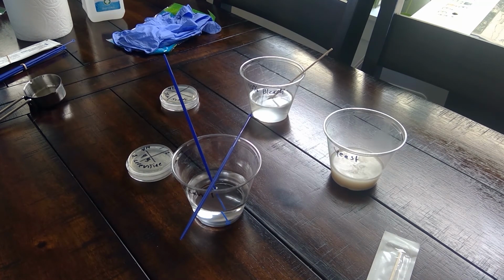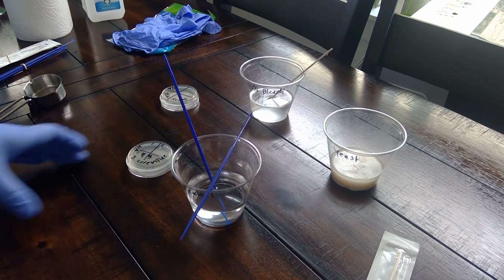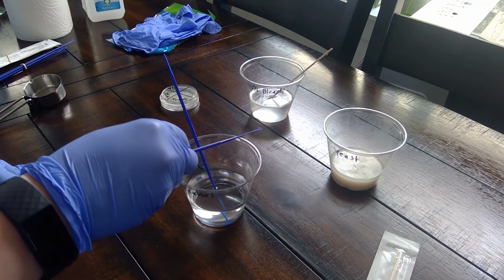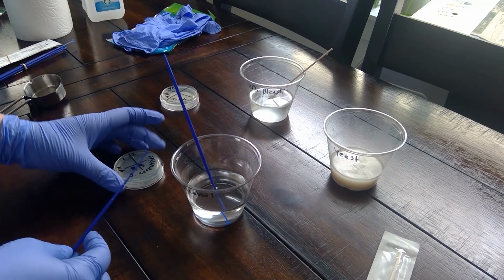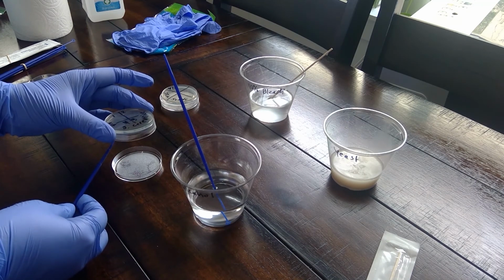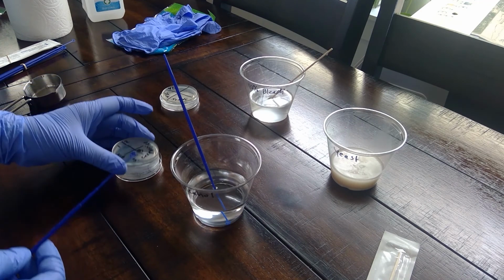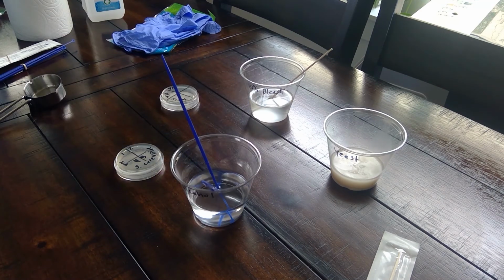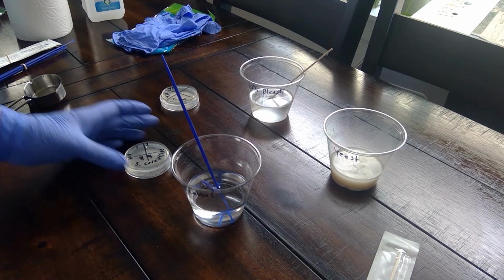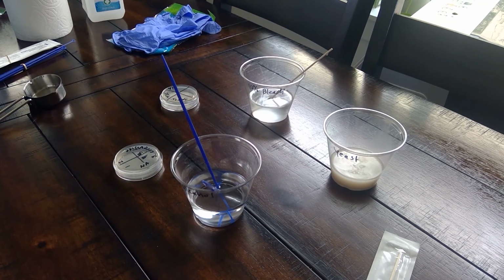And then we're going to transfer from quadrant 2 to quadrant 3. And yeah, this looks dry. So I'll transfer from quadrant 2 to quadrant 3 in a zigzag pattern, and then stick it back in the alcohol and close the lid. So we just did from 2 to 3, and then we still have from 3 to 4.